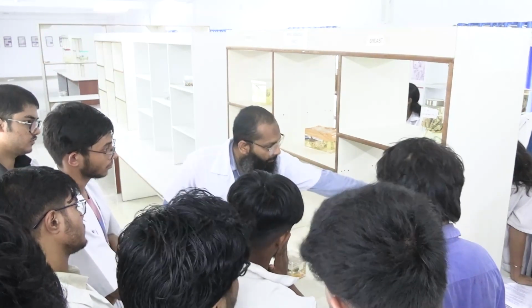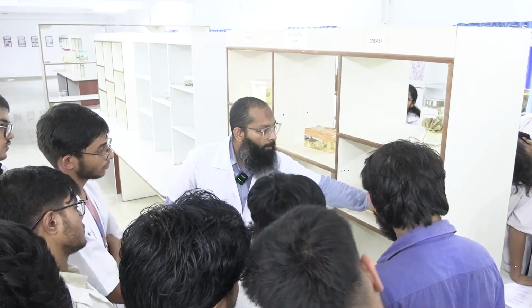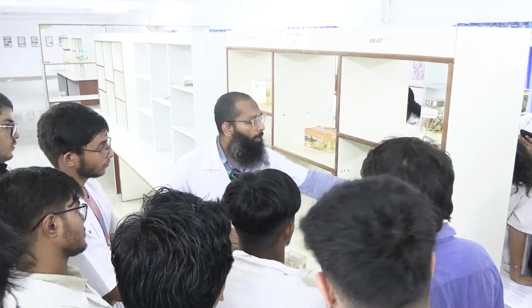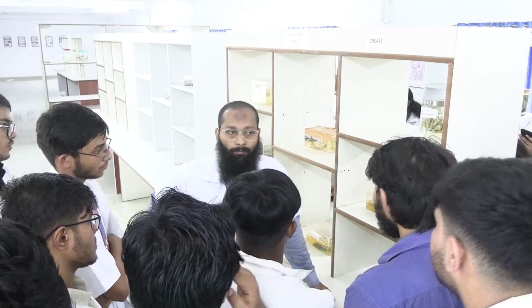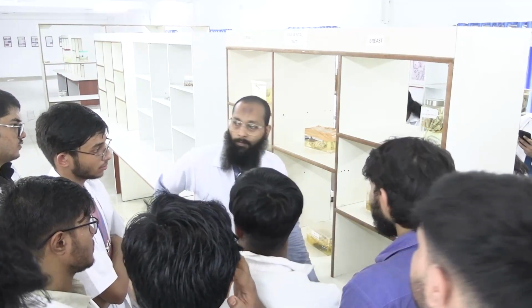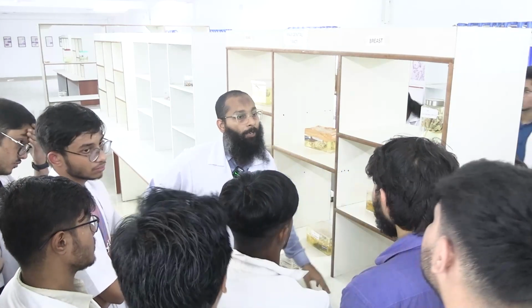A specimen is of this size. Do you think the central part of the specimen will be penetrated by the formalin? So what can we do? The middle part will remain unfixed, right? So what should be done? It is cut like this. We call this pre-grossing.